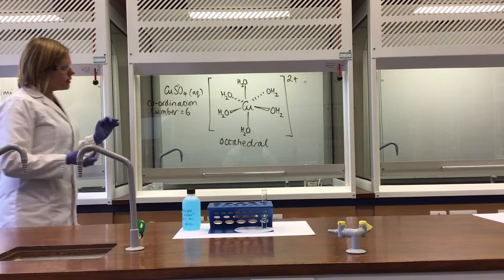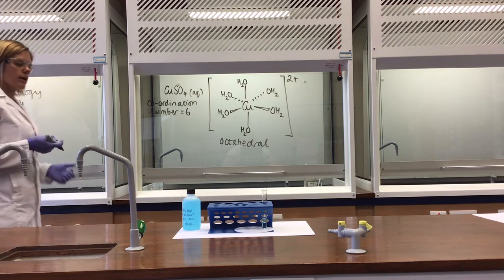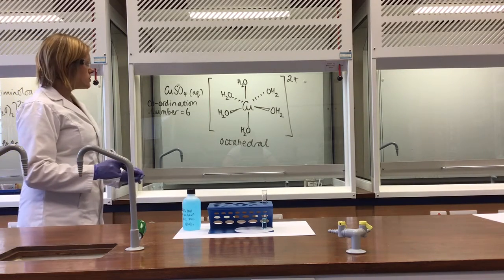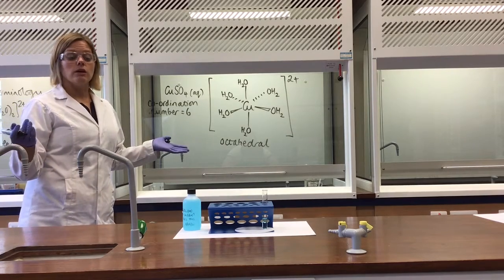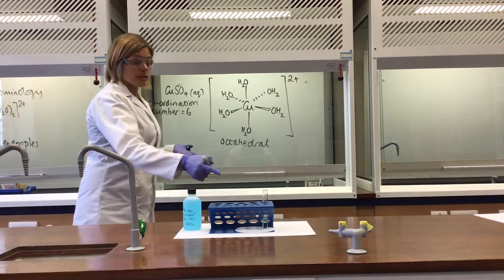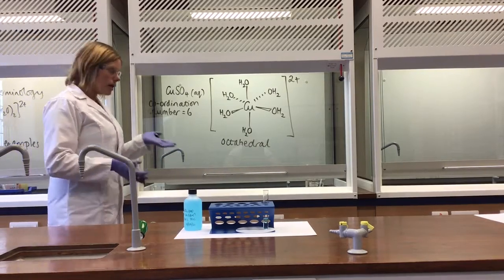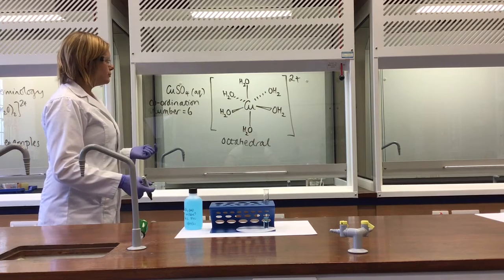So, bits of terminology then relating to transition metals. There are lots of the key properties of transition metal ions here that you can see all in this one very straightforward test tube of copper sulfate solution. Firstly, lots of transition metal ions are colourful. And this one particularly is blue. We will meet different coloured examples which you need to learn, but we'll also meet the origin of the colours of those later in the course.